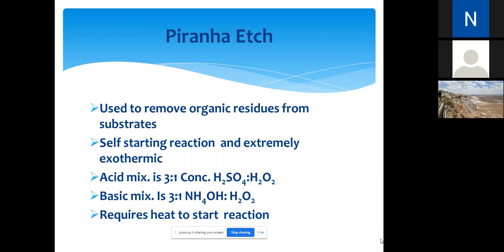All right? Always be aware of reactions that happen when you're not watching. And if you read your safety data sheets, I'm sure you'll get that information, that this reaction does not finish as soon as you're done mixing it. It's going to continue fuming for a few more hours, so you don't cap it, otherwise it will explode.